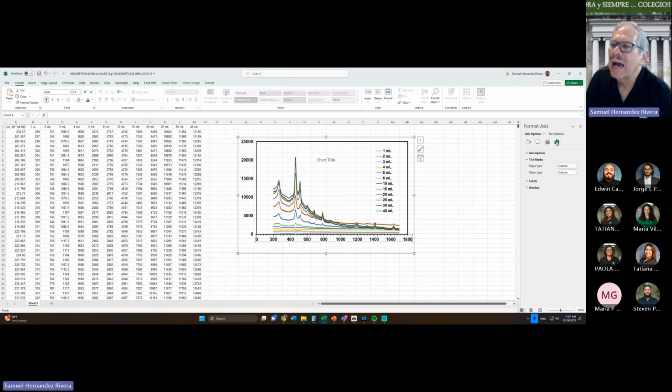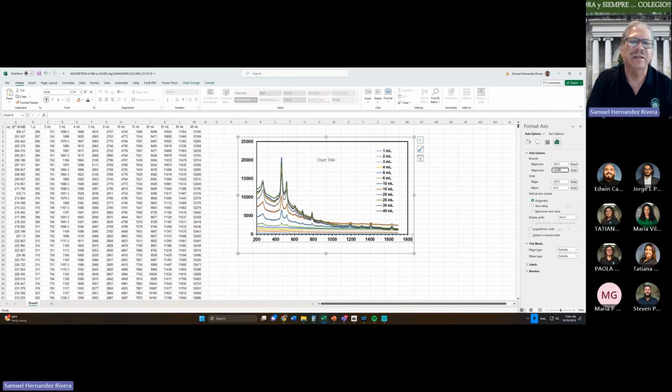Okay, go back and select on axis options. Let's start with 200 wave numbers. There's no information below 200. Before you hit 200, sit on top the maximum. That's it. Okay, great. Okay, the maximum, it doesn't go all the way to 1800. So let's put that 1700. Okay, all right. And let's do the same with the y-axis.